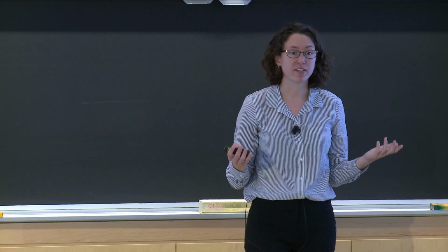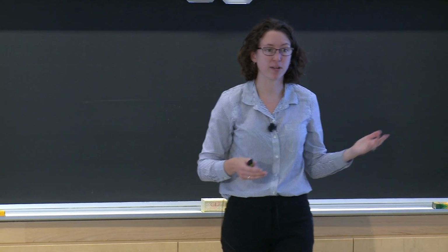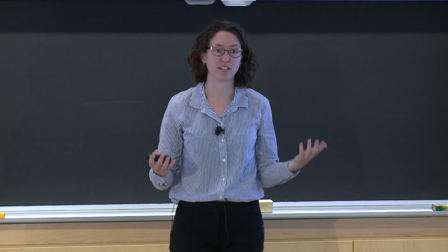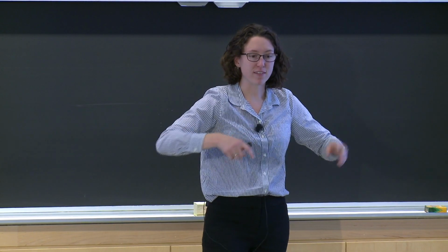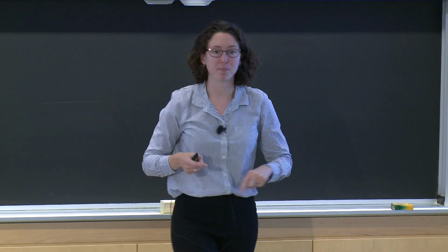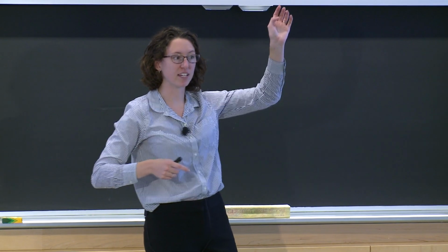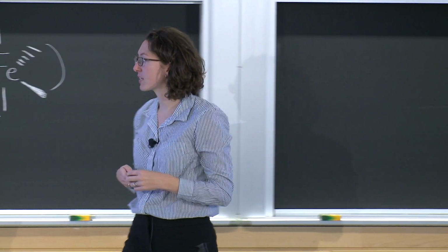And you can also compare the R-squared values of the line with the point and without the data point, and if it gets closer to 1 when you remove it, then it is more linear. You obviously don't want to be taking out data points left and right until you only have like your 3 best points that give you a super straight line. But if there are any that are very obviously not on the line, then that is one way that you can remove them.